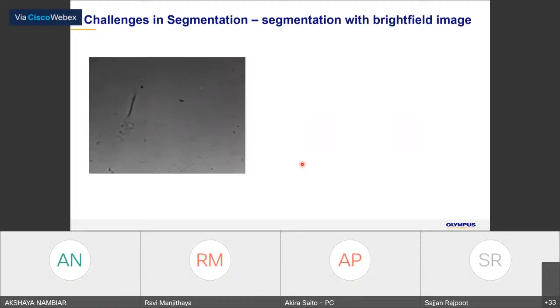And also in the bright field image, sorry, this is the bright field image, not DIC or phase contrast. You can see there are a couple of cells over here, but you can also see some dust, and the image is uneven.